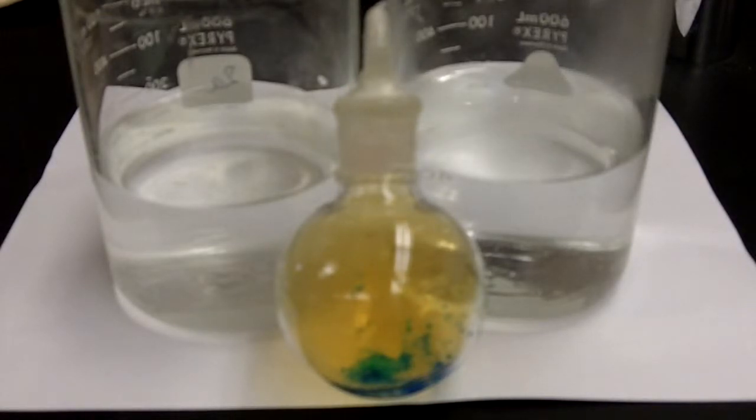Background: countless chemical and physical processes that occur around us every day fit into the category of reversible processes. The balance attained between each half of a given process is called dynamic equilibrium. The equilibrium that is established in a reversible process can be altered when an outside stress is placed upon that equilibrium. In this lab, you will be investigating the effects of several stresses on chemical and physical equilibriums.